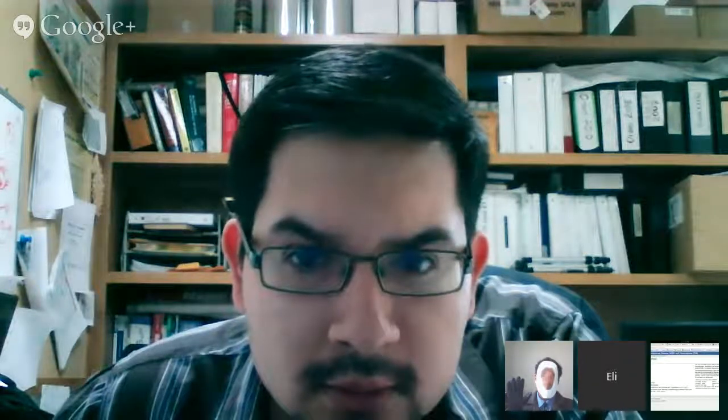I would recommend the reference genome 3 from B73. Okay, so B73 version 3? Yes, I think version 2 had a duplication error with the chromosomes. Oh, okay. Then we need to find version 3, because this is version 2 here. This one, let's see what this version is. It says 1.20. Do you know where version 3 is available from?